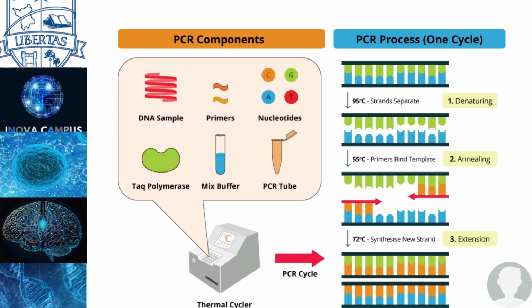When we do this whole process of denaturing, annealing, that is using the primer, and then extending the DNA copy, sealing it with the DNA polymerase, we call it a cycle. That's a PCR cycle. But back then when Kary Mullis did it, he had a problem. The PCR process was very hard to accomplish, because our natural DNA polymerase is not resistant to high temperatures, as we know.